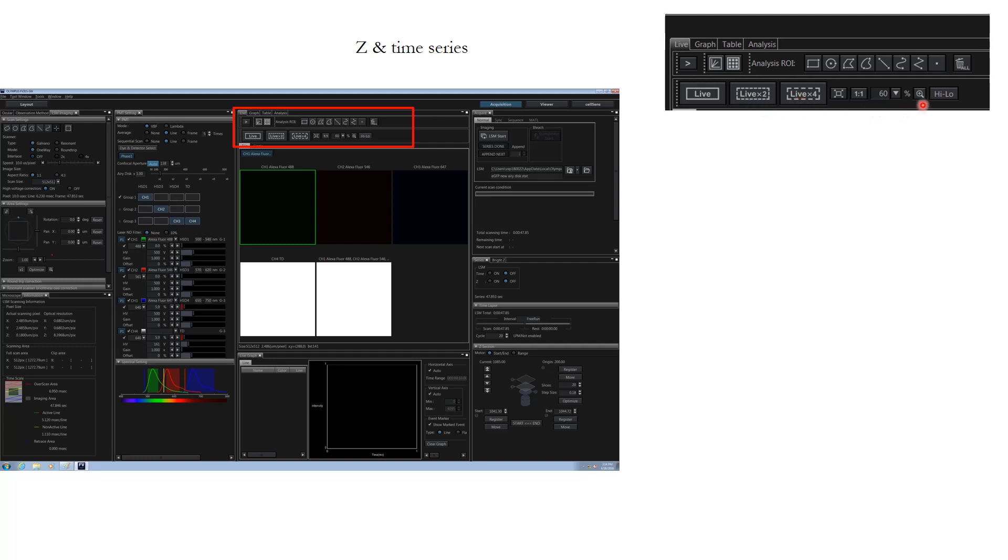What is this high low option? High low is an option which you can use to highlight the pixels which are zero in signal and are saturated in signal. Why is this useful?